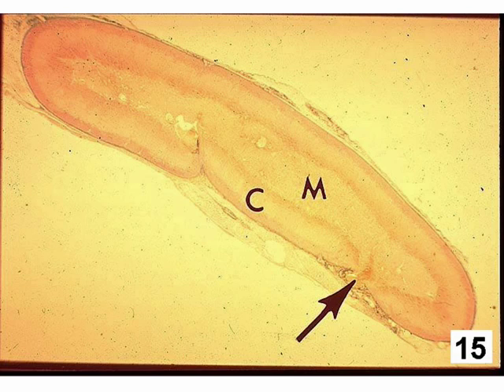Now we're going to move on to the adrenal gland. And the adrenal gland sits just above the kidney. That is what gives it its name. We're looking at very low magnification at the entire adrenal gland in cross-section. And like many organs within the body that you will encounter, it has two main parts. The cortex, which is labeled C, which I'm tracing with the arrow, and then a central medulla, which is labeled M, which I'm also now tracing with the arrow.